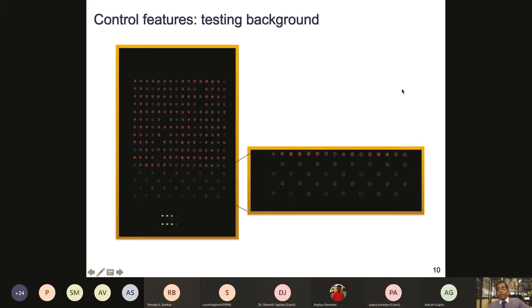Now, if you're looking at IgG response, immunoglobulin, for doing immunoassays on the chip, you should be thinking about printing some purified IgG with a dilution series from lower to higher concentration, and those will light up, which can help you decide what the immune response was, which can be compared with the proteins expressed on the chip.